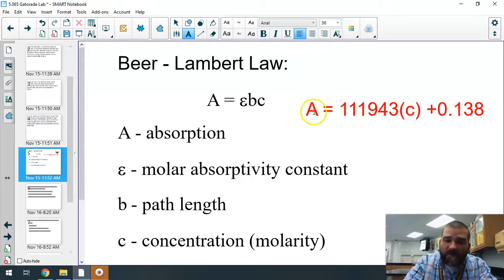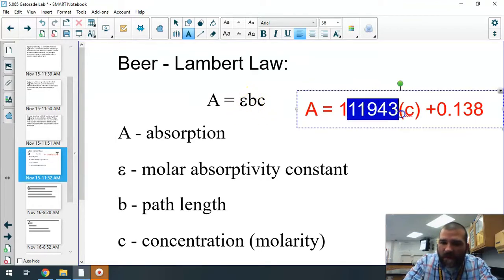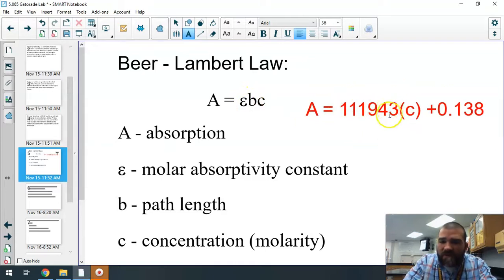And then we can plug the absorbance into our expression, use the slope, or in other words, the molar absorptivity, right? Because we know our path length B is 1. So the slope is our molar absorptivity. It's this huge number, really. If we shrink it down for sig figs, 1.12 times 10 to the 5th. The label for that is 1 over centimeters, 1 over molarity, if you remember that. But let's get our final problem.